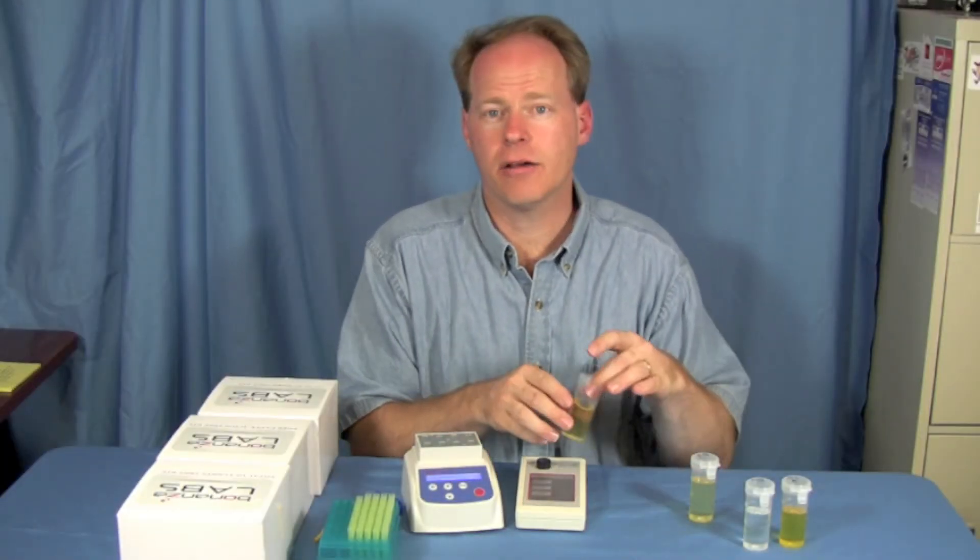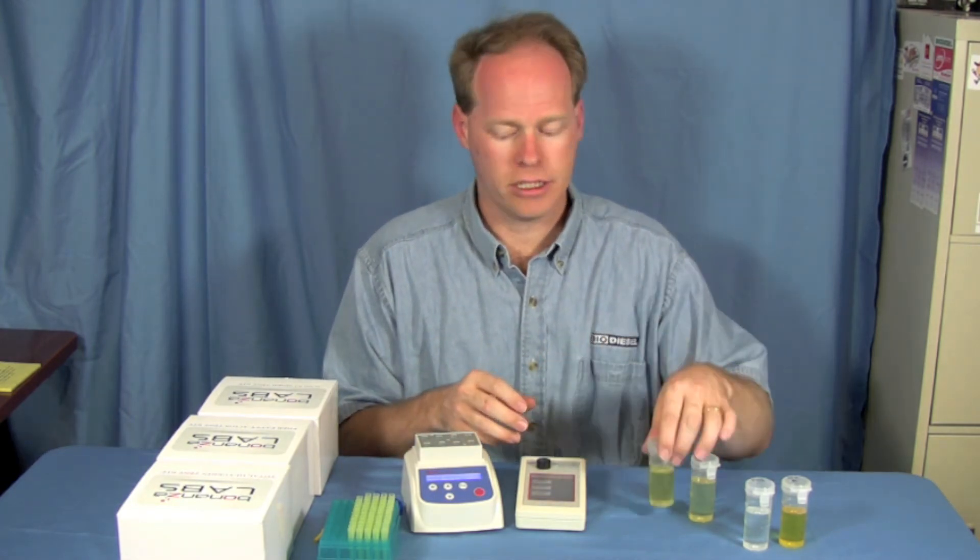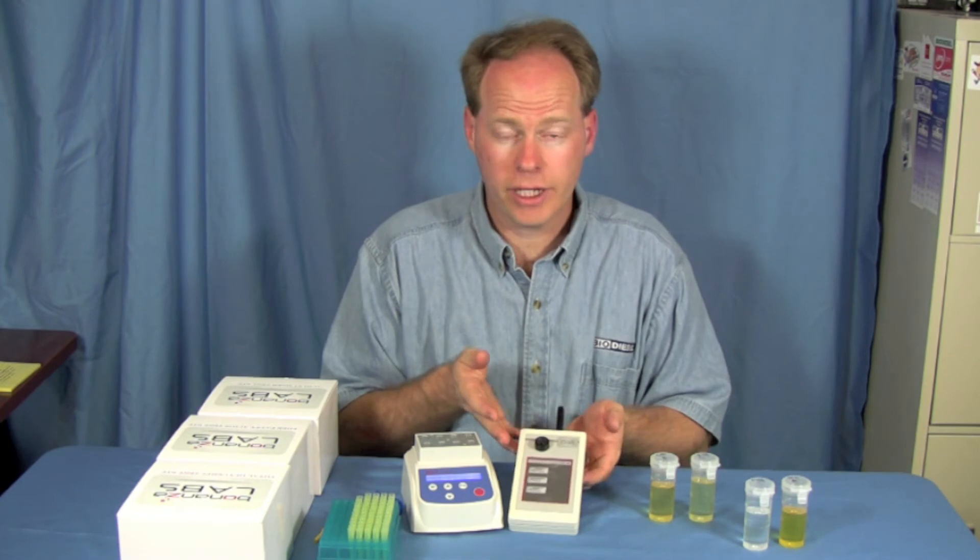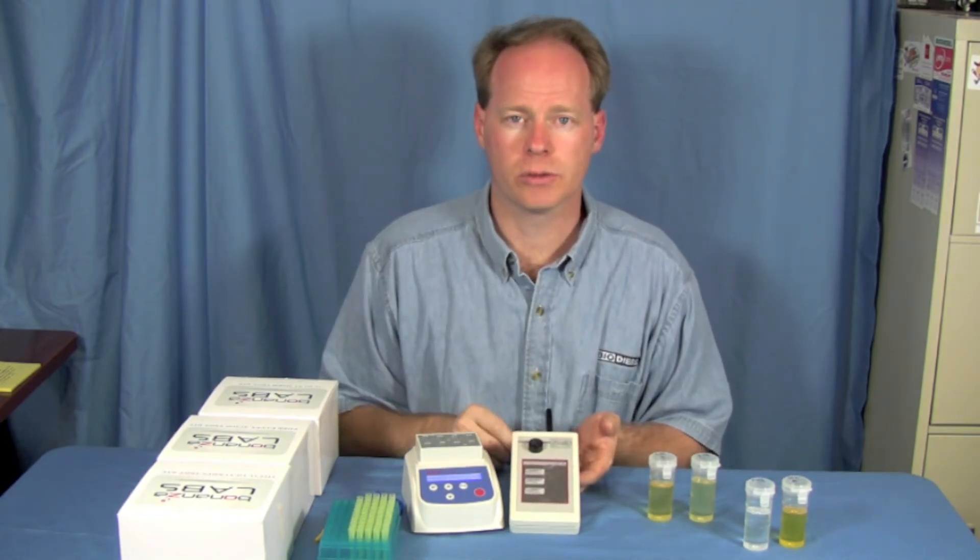Instead of having to send off each sample to a lab or have an in-house gas chromatograph do this test, you'll notice that we were able to do it very quickly. It took under ten minutes, about ten minutes per sample, and we knew what our total glycerin numbers were.